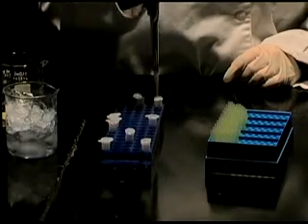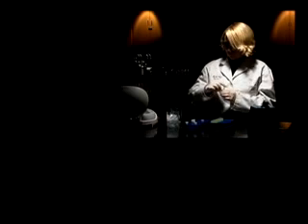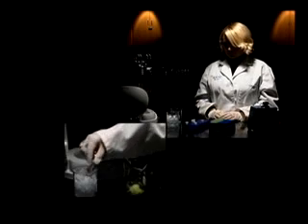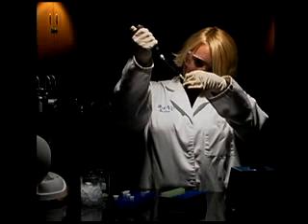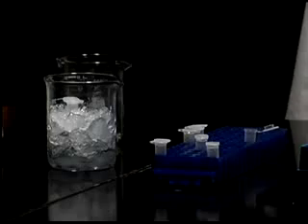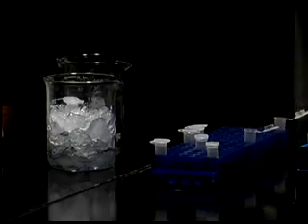Add ice-cold ethanol or isopropanol, mix thoroughly, and place it on ice for 5 minutes. The plasmid will now start to precipitate. Centrifuge this tube at full speed for 10 minutes to form a pellet of plasmid in the lower part of the tube. Carefully remove the supernatant with a transfer pipette without touching the sides of the tube. Leave the tube open and allow the pellet to air dry for approximately 10 minutes.